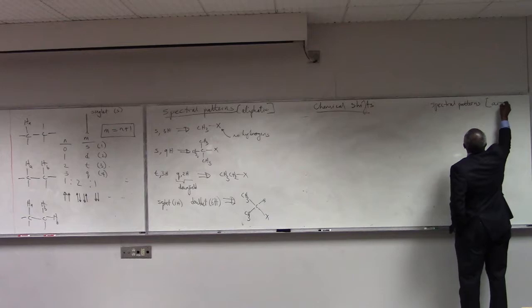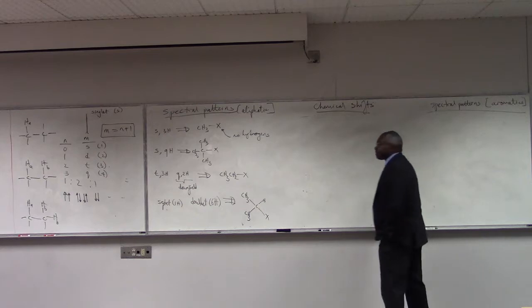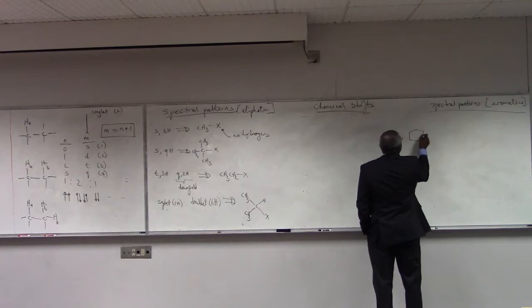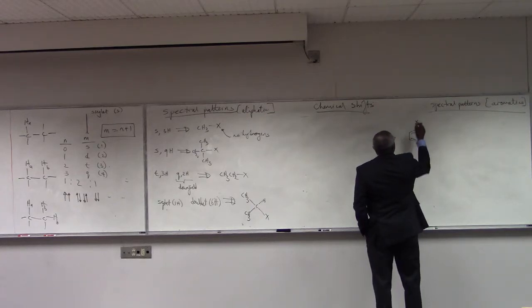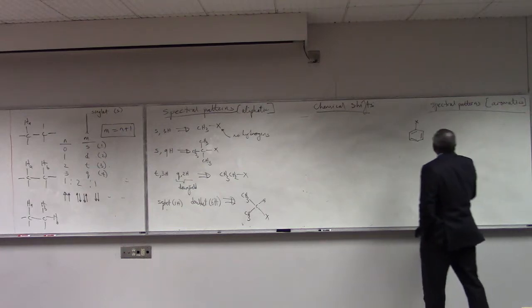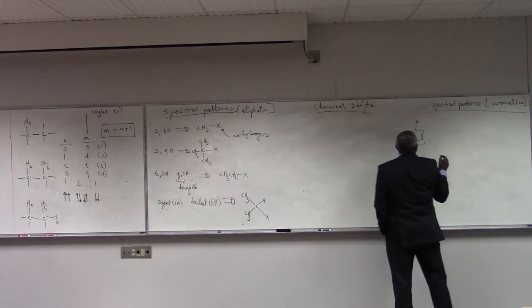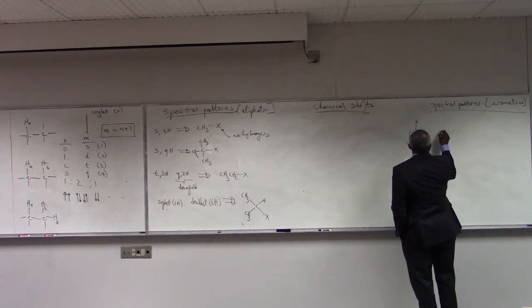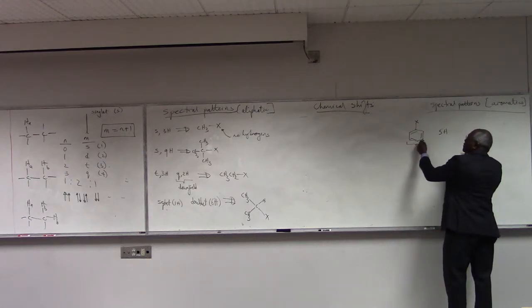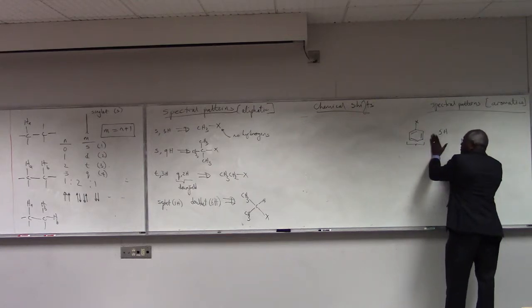These are for aromatics. There are several of these that we can look at. I'm going to limit it to just a few. If I have a benzene ring that is monosubstituted, first of all, the aromatic ring will integrate for 5 H's. Right? So I'm going to get an integral for 5 H's because I've got 1, 2, 3, 4, 5 H's on a benzene ring. So if it's monosubstituted, it will integrate for 5 H's.